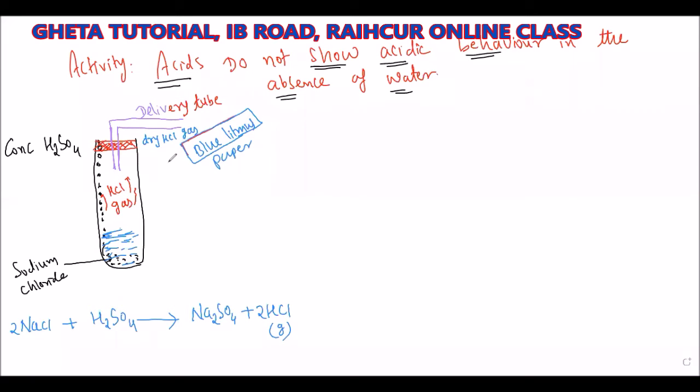then you have to use one guard tube. In this guard tube, calcium chloride is present. The guard tube is given in your textbook, where a small diagram is given on the side. You have to use the guard tube here.